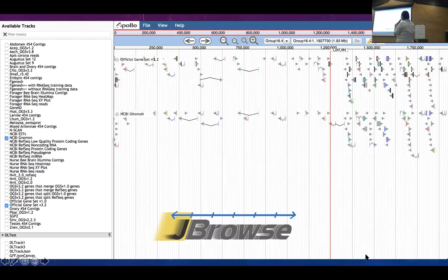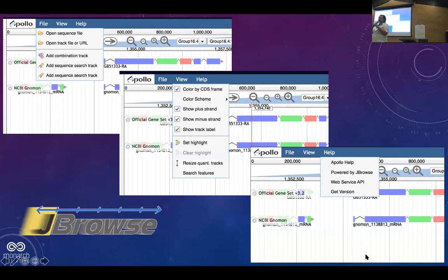On the left, this is a massive collection of data that includes gene models, includes aligned RNA-seq reads, and so on. I'm sorry that it's so difficult to see. You don't need to read what all of these are, but it's just an example of a genome that had a lot of data available. What you see over here then is the list, and over here on the right, the area where you display all of the genes that you have uploaded. You have a lot of different functionality when you are just looking at the browser without having logged in.